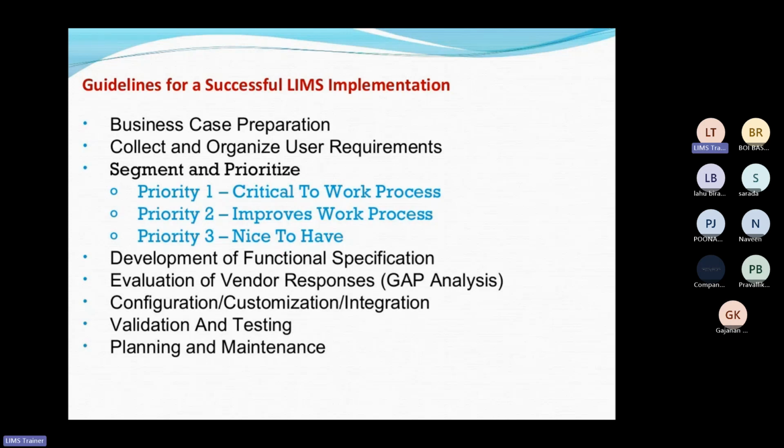In general, in the IT industry, there are 99% chances that they are into LIMS implementation. Why am I saying this? Because they are the developers of the software, and they want to implement their software into the laboratory. The pharmaceutical industry or any other industry that is going to utilize that particular software is mostly involved in implementation.